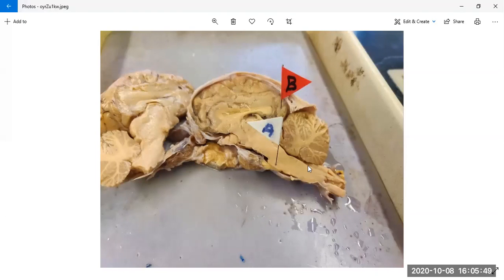This one is the same thing we saw earlier. This one is the medulla oblongata, and this bumpy structure is the pons, and it will go up, and then this one is the corpus callosum, the white sheet, and in the back is the cerebellum. And I believe this one is the occipital lobe because this is the cortex, and at the back of the cortex is always the occipital lobe. Occipital lobe is the vision center.